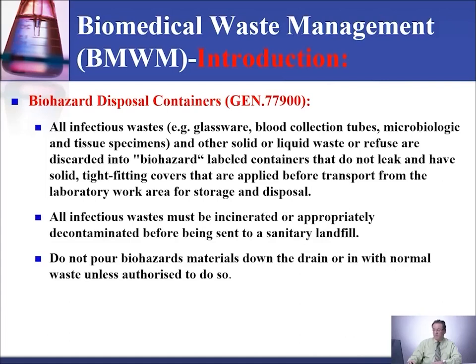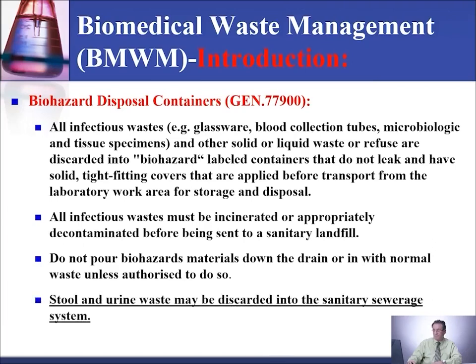All infectious waste must be incinerated or appropriately decontaminated before being sent to a sanitary landfill. Do not pour biohazard material down the drain or in with normal waste unless authorized to do so. Stool and urine waste may be discarded into the sanitary sewage system.